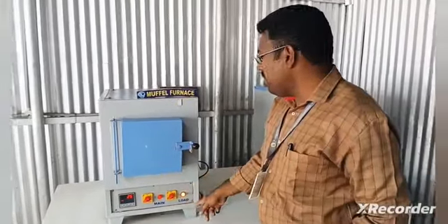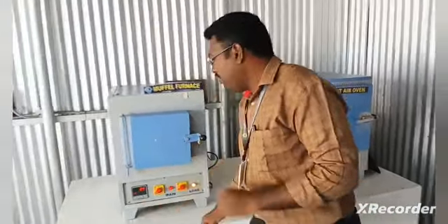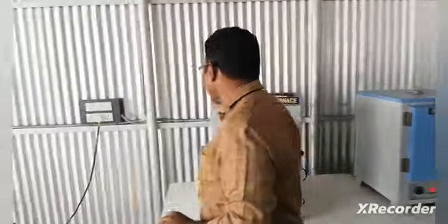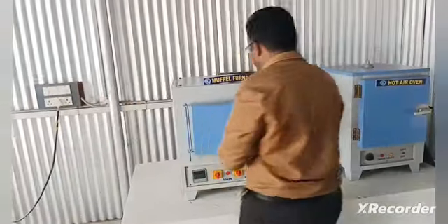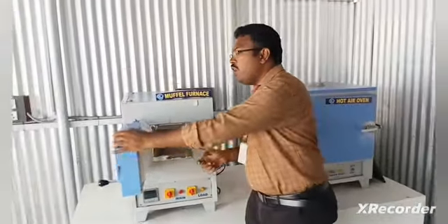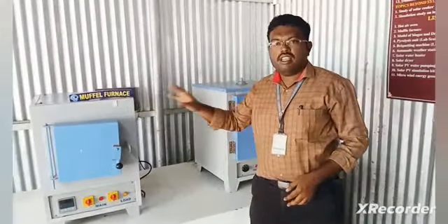Once the temperature is set, the muffle furnace gets on. If you want the maximum temperature, you can set it here. After heating, switch off all these conditions and turn the key switch off. After switching off, take the heated biomass material from here and weigh it once again. From this, we are going to calculate the amount of moisture content, that is volatile matter, and the amount of ash content from this muffle furnace. Let's see the calculation.